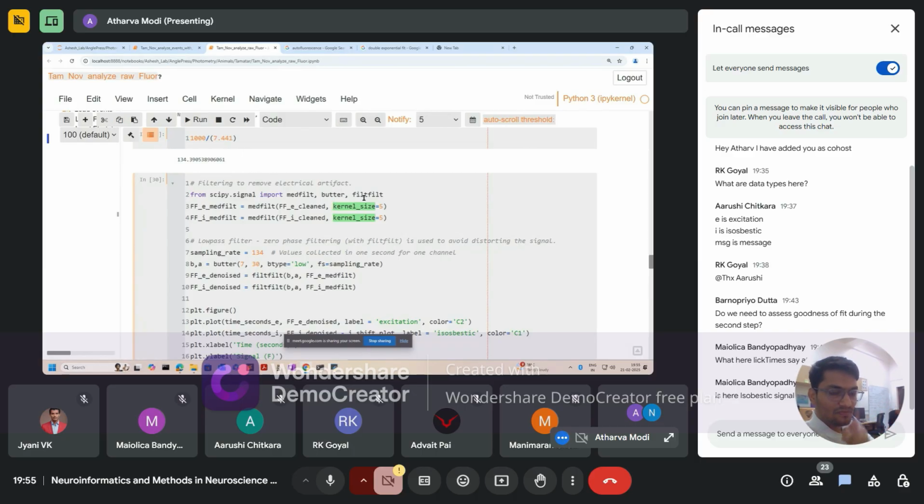Basically, t minus 2 is 2 time steps back, what did you get? 1 time step back, what did you get? t0 is the current time step, and then further 2 time steps. This is for window size 5. Similarly, you can have different window sizes. So with these 5 values, you find the median and report that as your signal.